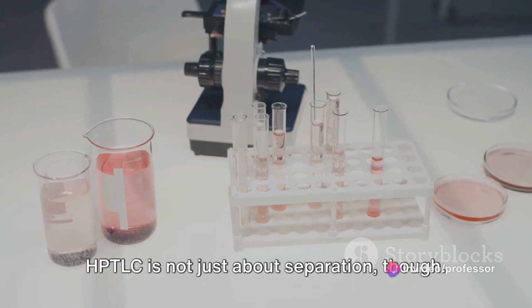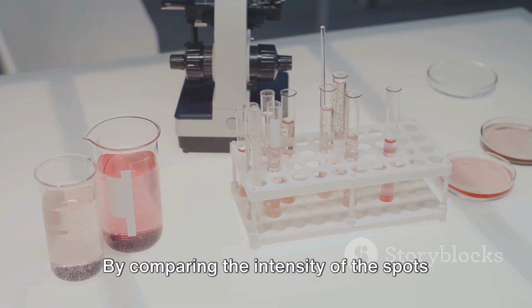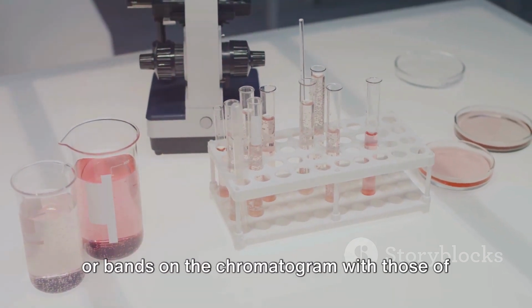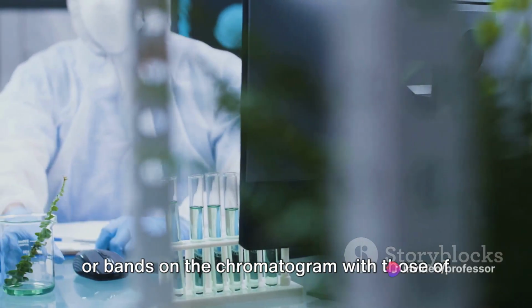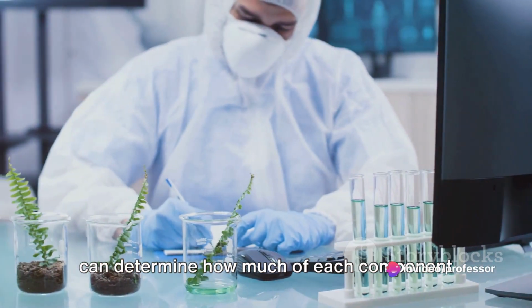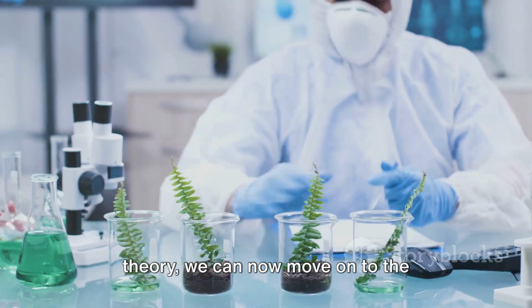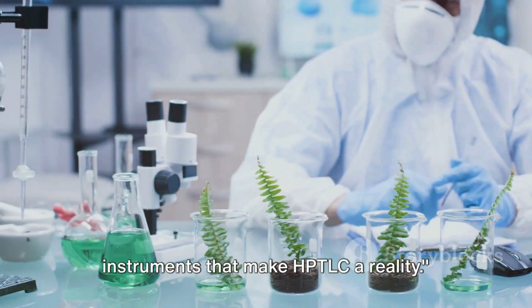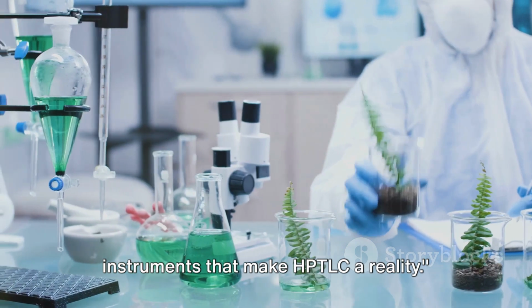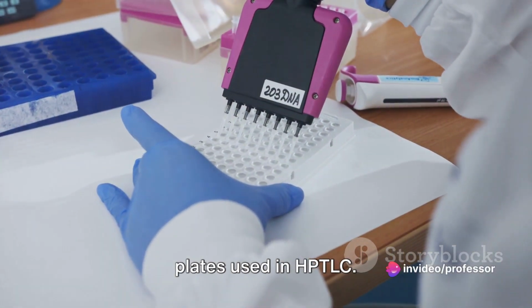HPTLC is not just about separation though, it's also about quantification. By comparing the intensity of the spots or bands on the chromatogram with those of known amounts of the same substances, we can determine how much of each component is present in the mixture. With a solid understanding of the theory, we can now move on to the instruments that make HPTLC a reality. Now let's discuss the instruments and plates used in HPTLC.